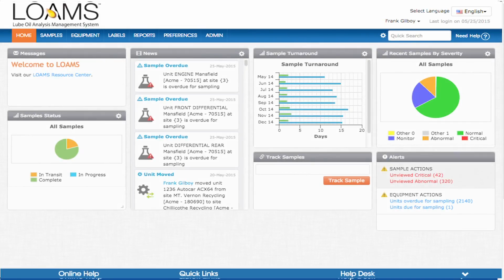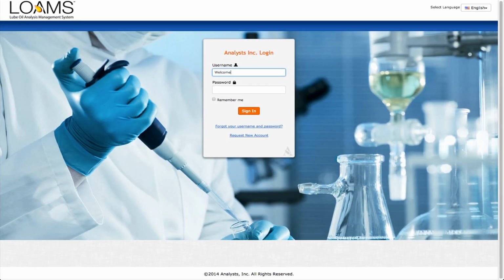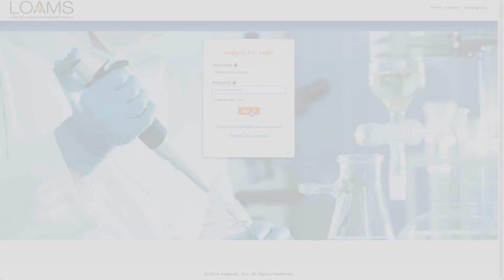Welcome to LOAMS, the Lube Oil Analysis Management System. To get started, go to www.analystinconline.com. Creating a new account is as easy as clicking Request New Account at the bottom of your screen. To log in, enter your username and password, then click Sign In.